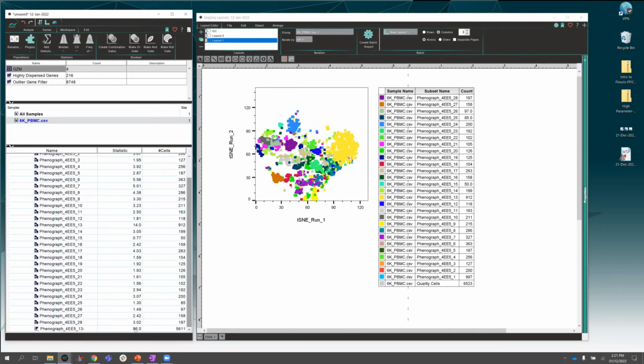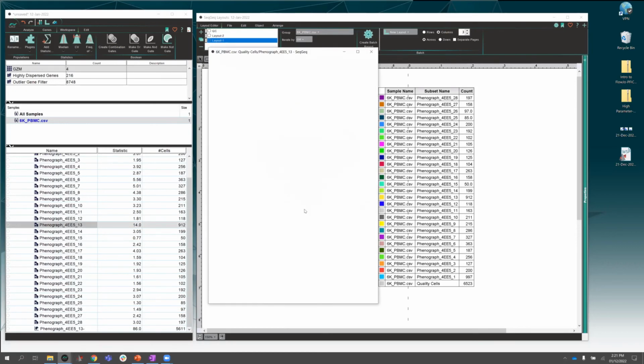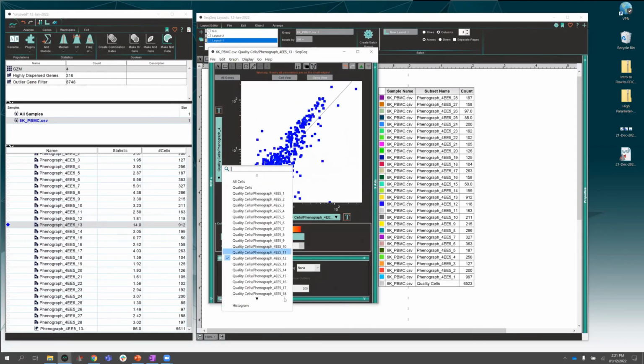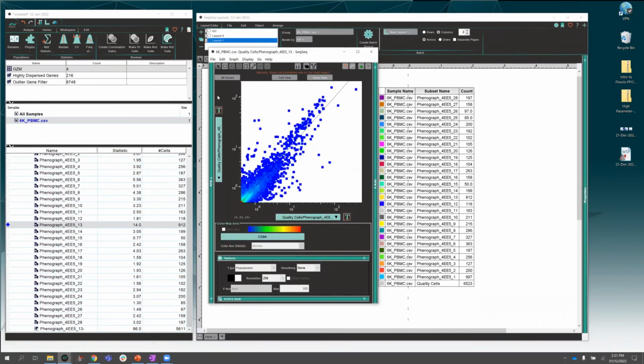So you can see how it's 86% of my events, right? Because it's all of my clusters except cluster 13. And so now I can do the same thing, but I have an actual bulk population to compare it to. So let's go ahead and pick cluster 13 again, but this time on this axis, I'm going to put not cluster 13. So cluster 13 and not cluster 13.